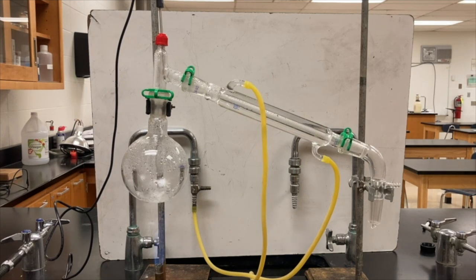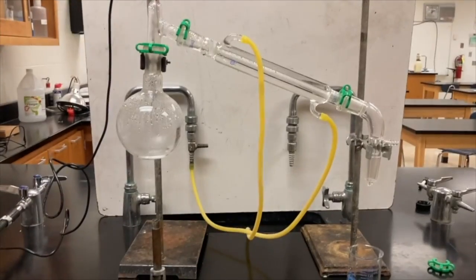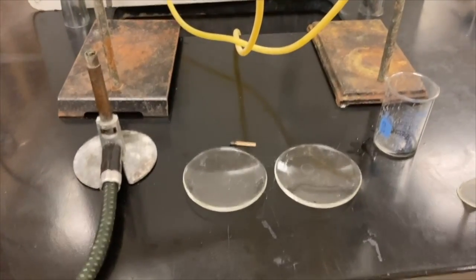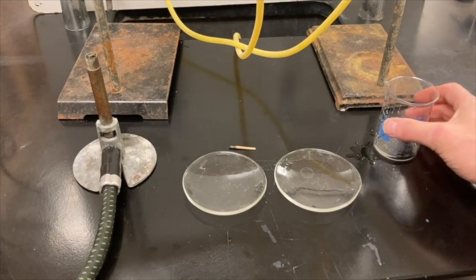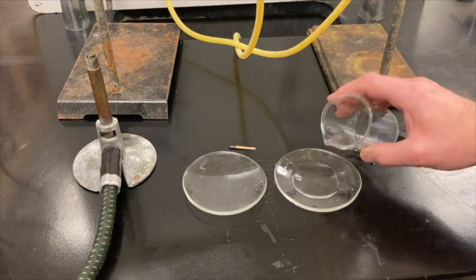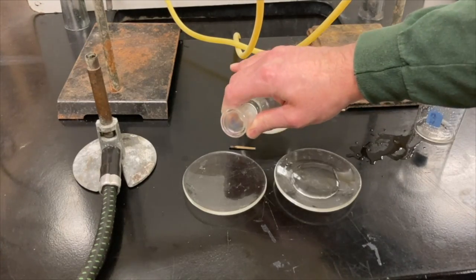At this point, I'm going to stop the distillation process because I think separation is probably pretty complete. So I've turned off the burner. And now let's focus in on these two watch glasses that I put on the table here. These are just shallow dishes. And I'm going to take the liquid that was coming out at the end there, that fell into this beaker, and pour that on one of the watch glasses, which I suspect is water, or nearly water.